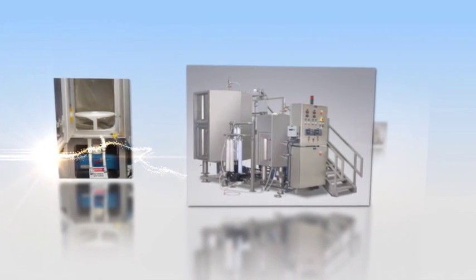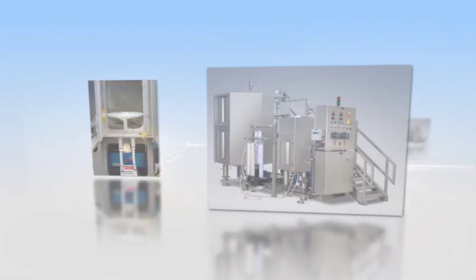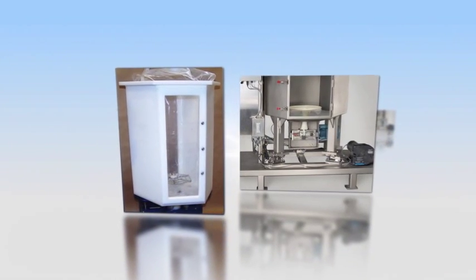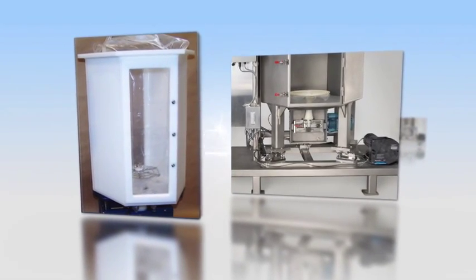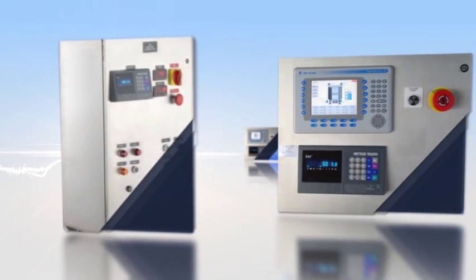ASI provides all disposable kits required to keep the system operating. In addition to the standard units and modular docking station platforms, ASI will design and build customized mixing systems to meet any specialized production requirement.